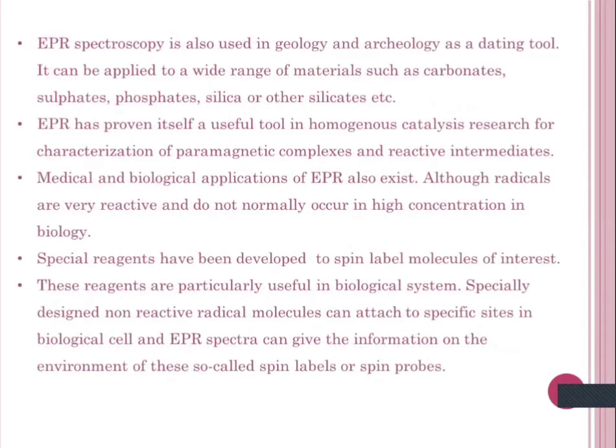Paramagnetic resonance or spin resonance spectroscopy is also used in geology and archaeology as a dating tool. It can be applied to a wide range of materials such as carbonates, sulfates, phosphates, silica, or other silicates.